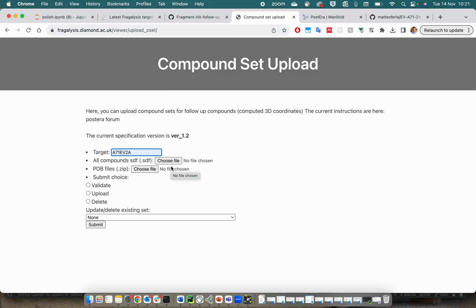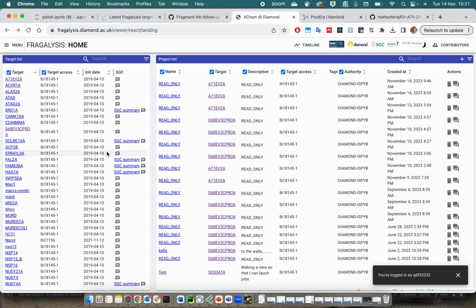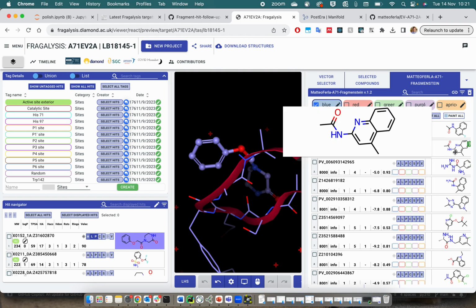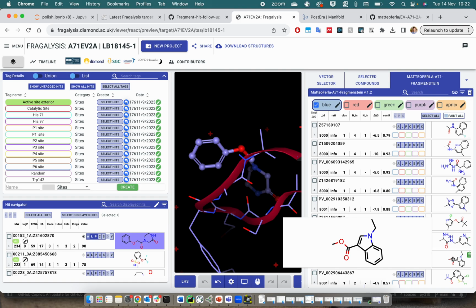It's generally that there are too many letters in the field. For example, the original smiles is what appears on the right-hand side of the compound, which, if we want to upload something with, say, more than 250 characters, we would have to make a fake molecule that appears in this compound on this right-hand side, because this is what controls that.